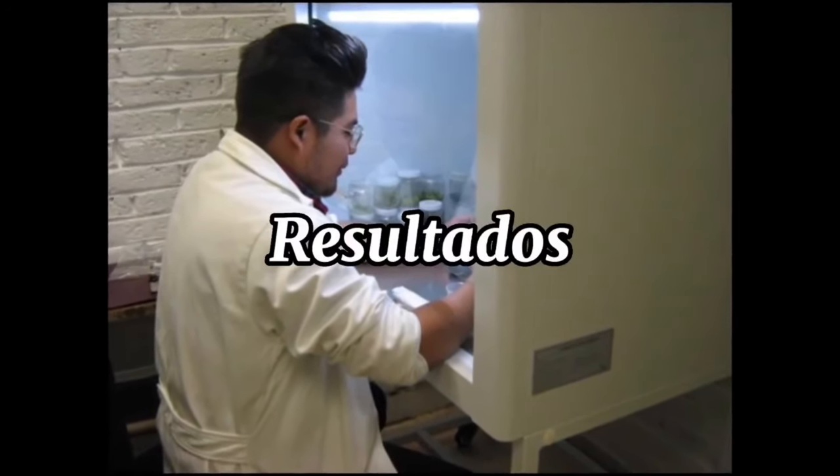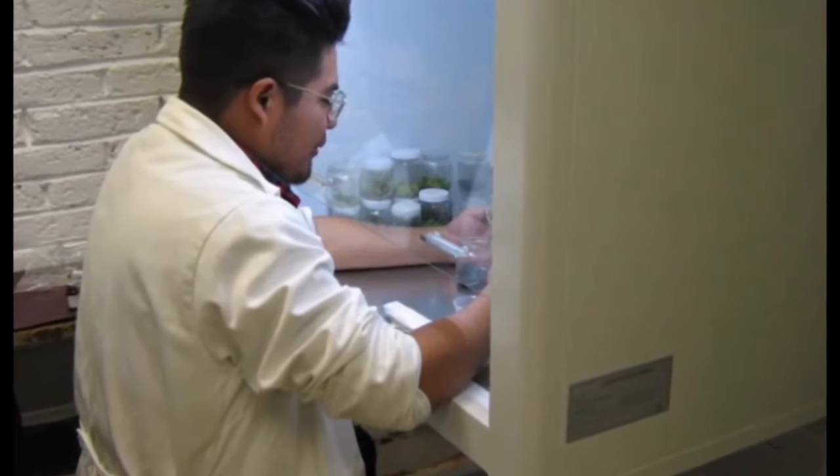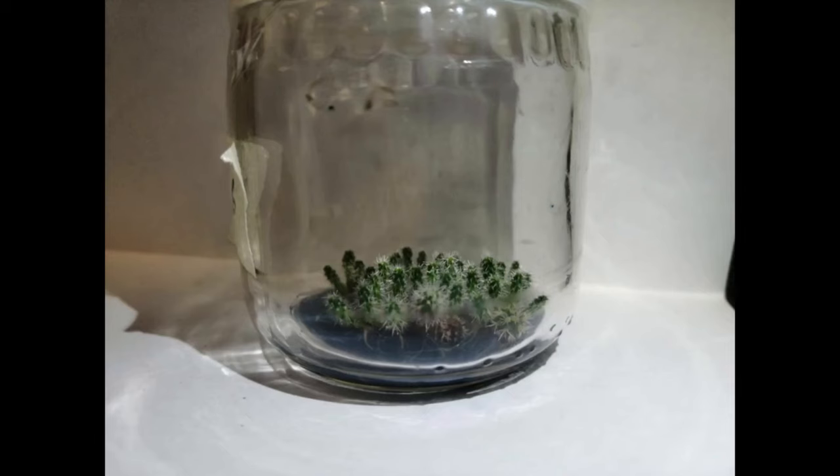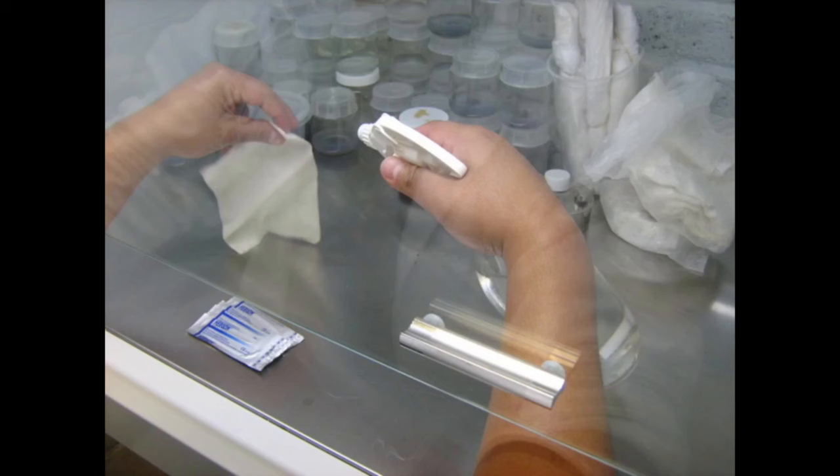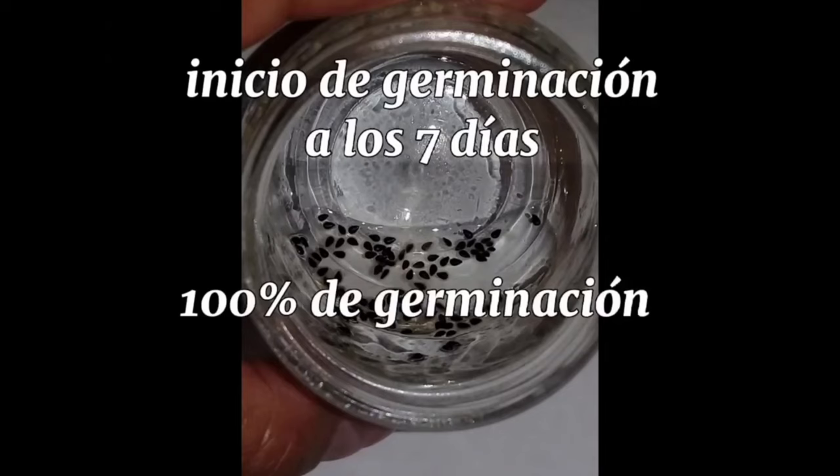Resultados y discusión. La escarificación química y el tiempo de exposición no causó daños al embrión. El uso de agentes abrasivos desintegra compuestos lipídicos de la testa, conduciendo a la aceleración de las dos primeras fases de germinación, como lo reporta Navarro et al 2008. La escarificación no afecta el porcentaje final, pero sí la velocidad de germinación. El protocolo de desinfección fue muy efectivo, ya que no se presentó contaminación. La germinación se inició a los 7 días, alcanzando el 100% a los 15 días.